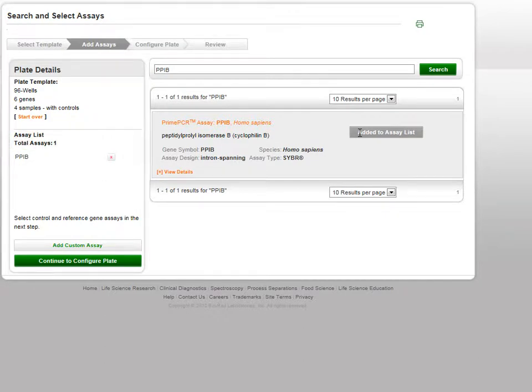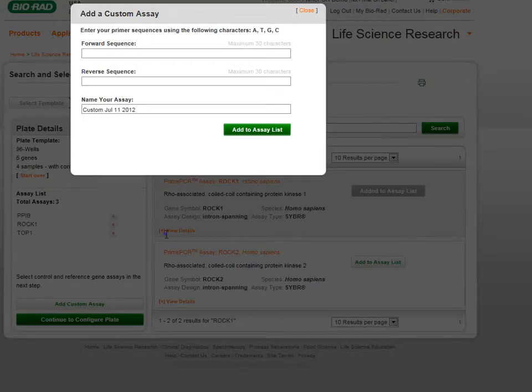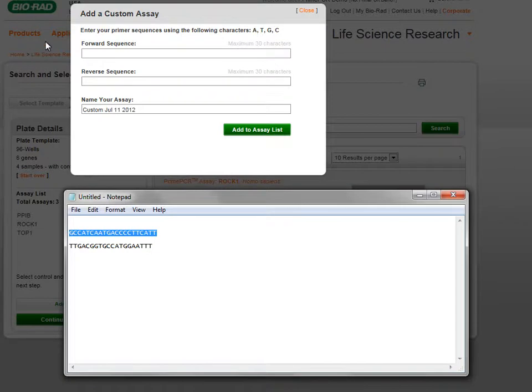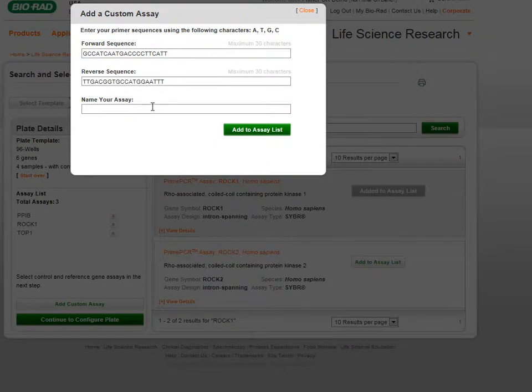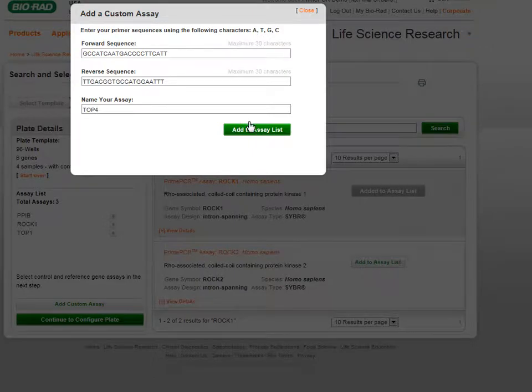If you wish to select a different template, you can click Start Over and you will be returned to the beginning of the plate wizard. To remove an assay from the list, click on the red X in the assay list. You can also add a custom assay by clicking the Add Custom Assay button on the bottom left of the page. An overlay will open for you to enter your forward and reverse sequences. You will also be asked to name your assay. The custom assay will be listed with the gene symbol of C-001 to prevent overlap with existing gene symbols.